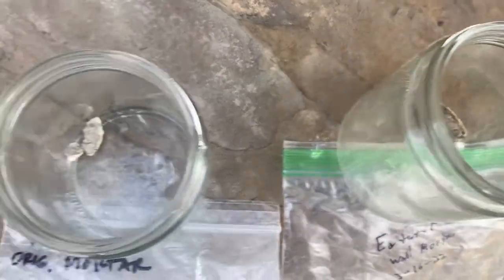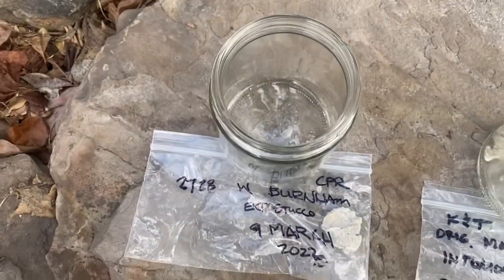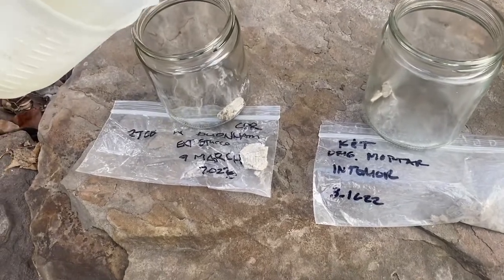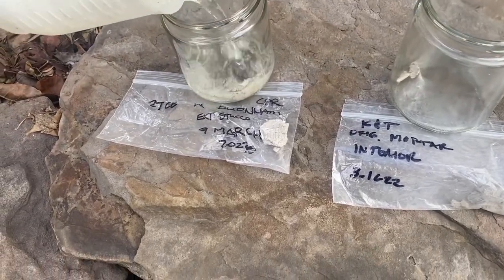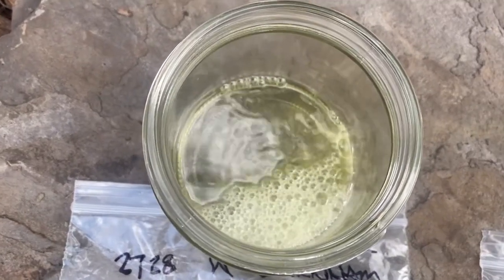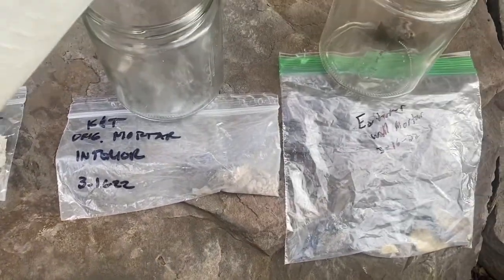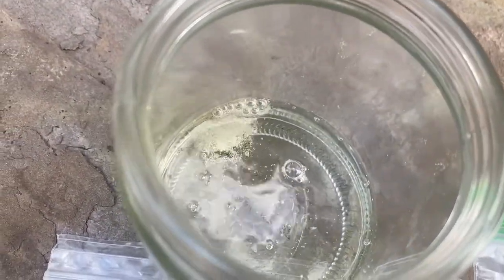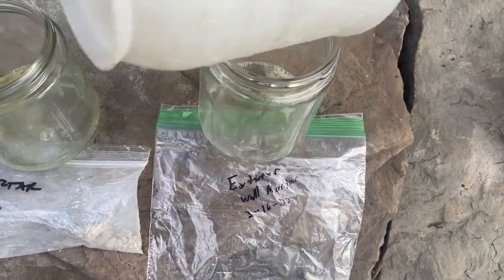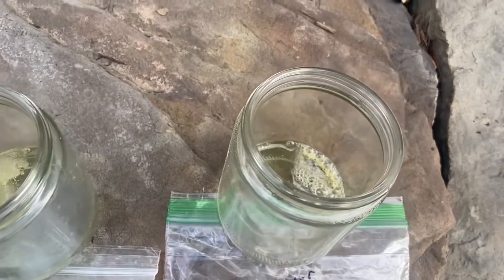So you can see that I've got these samples inside and this is muriatic acid. You can see that that's fizzing. This one is fizzing, maybe not quite as much. Then I'll put the final one in.